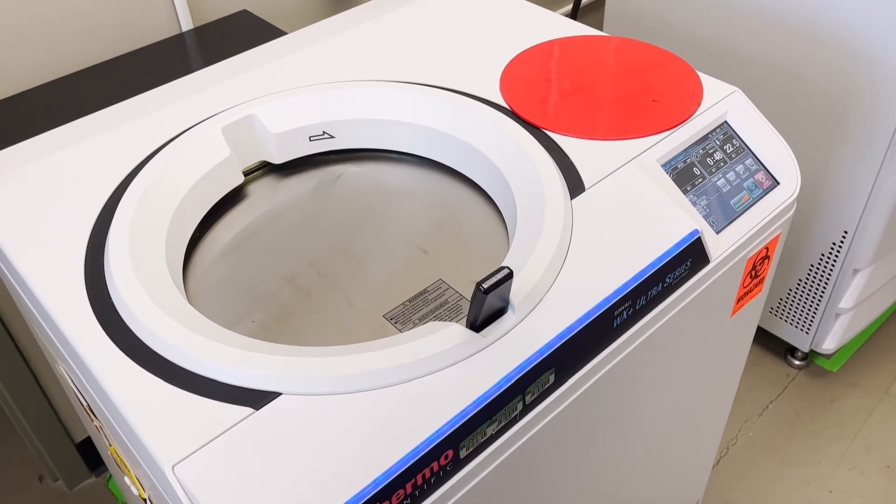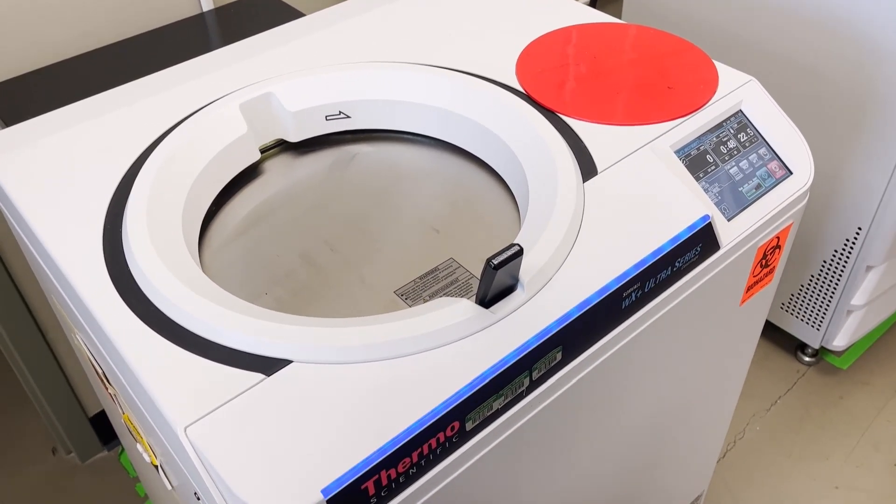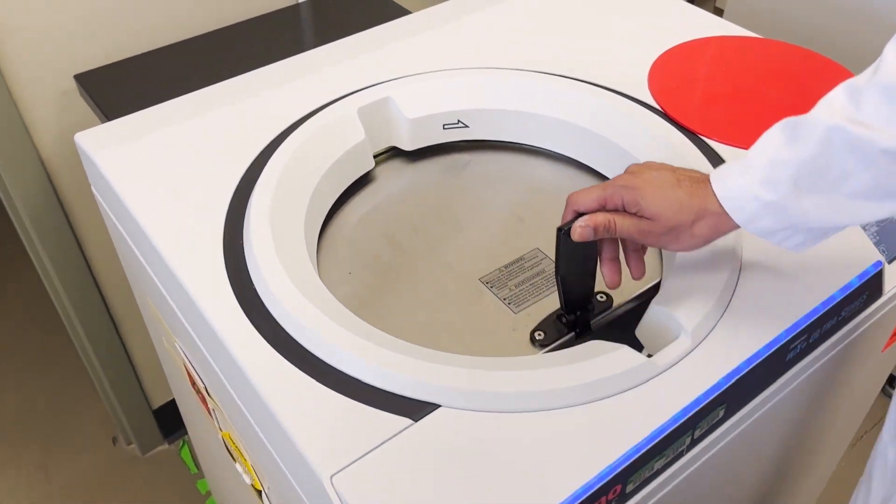Hit the vacuum button to release the vacuum. The lid will not be openable until the vacuum is fully released. Now it's released and the lid will open.